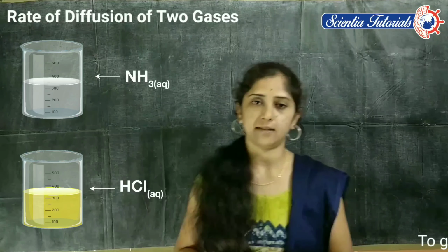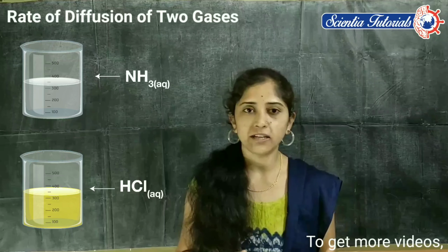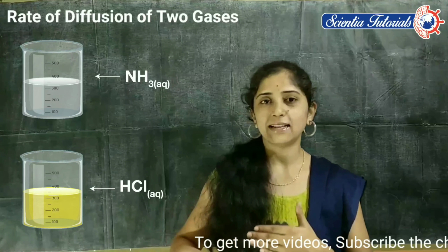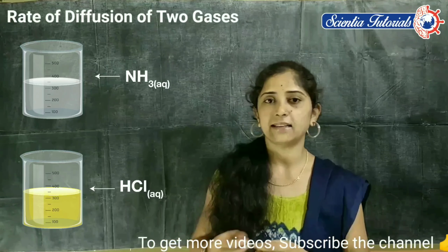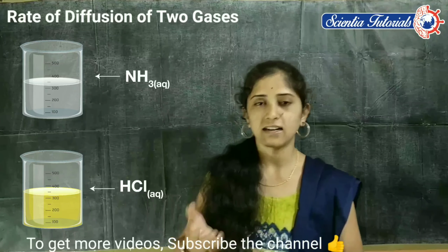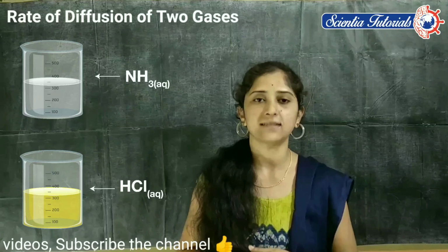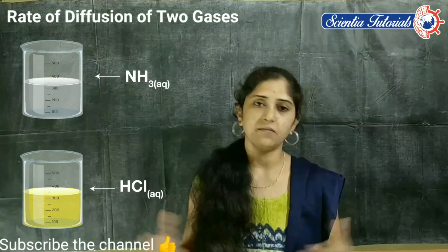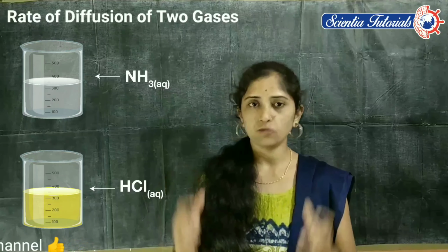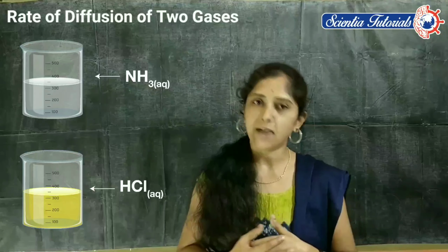So take care while doing the experiment with acid and ammonia solution. We have to maintain a certain distance while handling the ammonia solution or hydrochloric acid solution. They release fumes, and we should not inhale them. They may cause nausea and other discomfort in your body. I hope you follow these precautions while doing the lab activity.